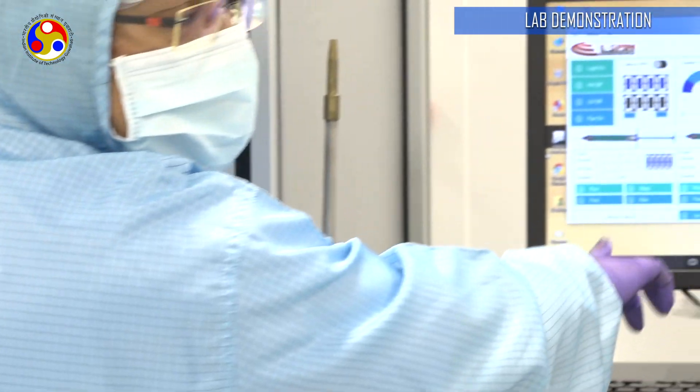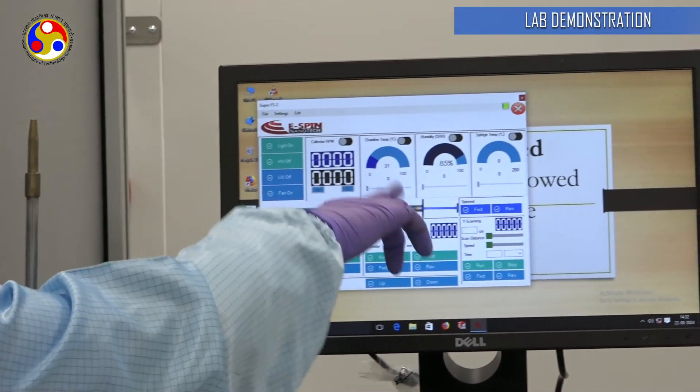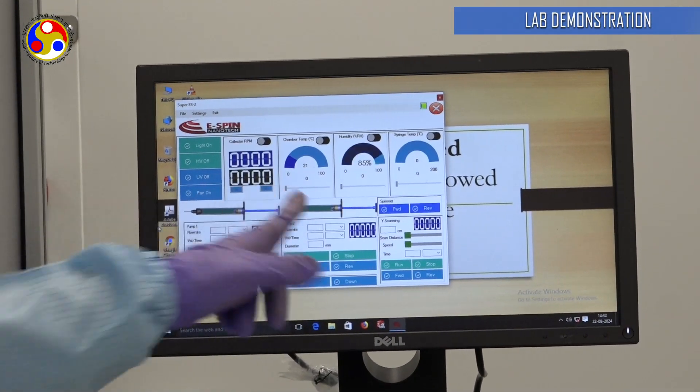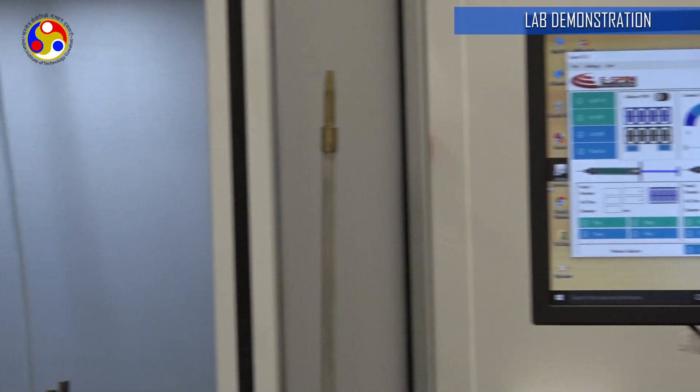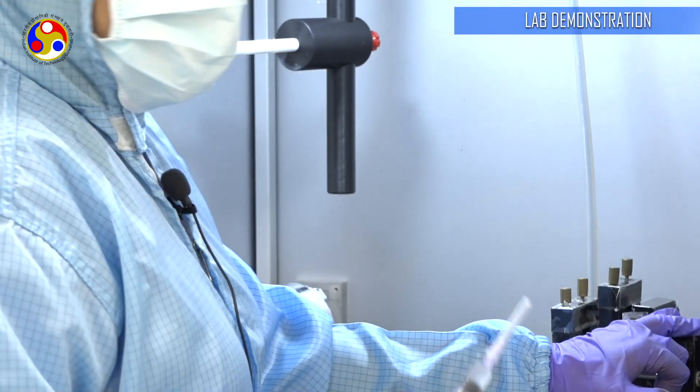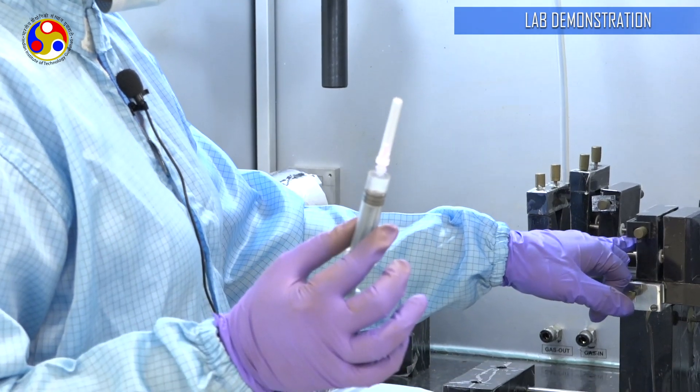This is the software interface of the device. We can control various parameters of the operation using this. I will show it to you. First, I am going to load this syringe with the sample on one of these syringe pumps.